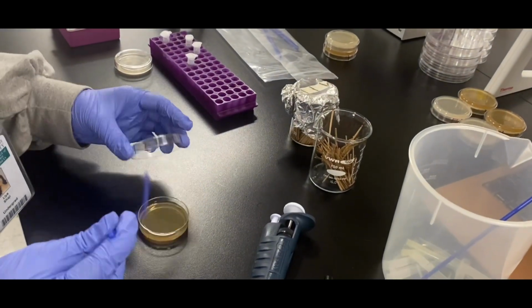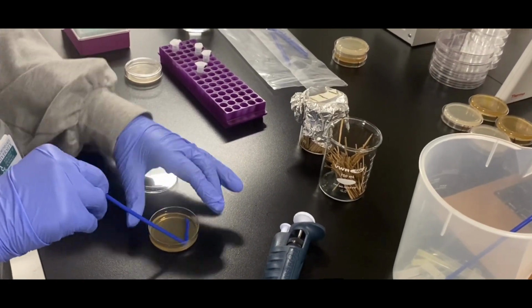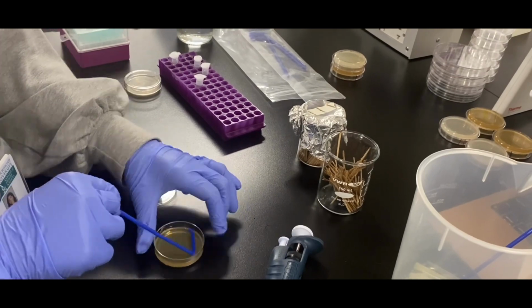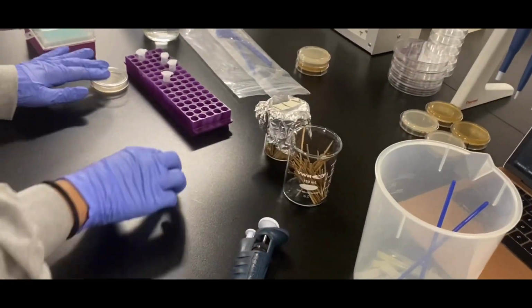Using a sterile spreader, slowly rotate the plate with one hand while moving the spreader up and down the plate lightly to evenly spread the material onto the plate. Place all of these plates into the incubator at 30 degrees Celsius.